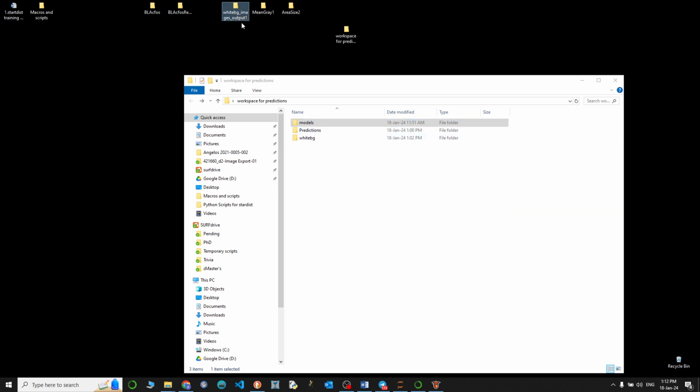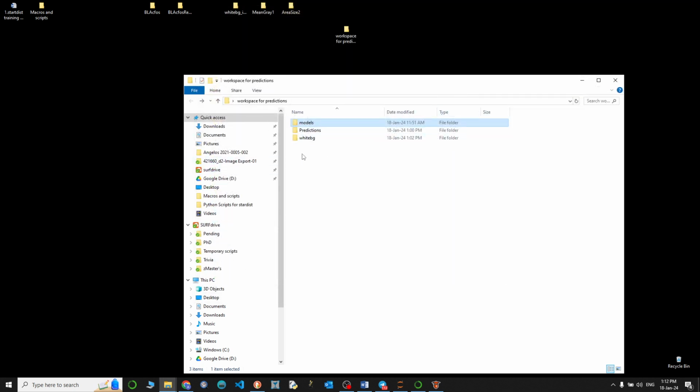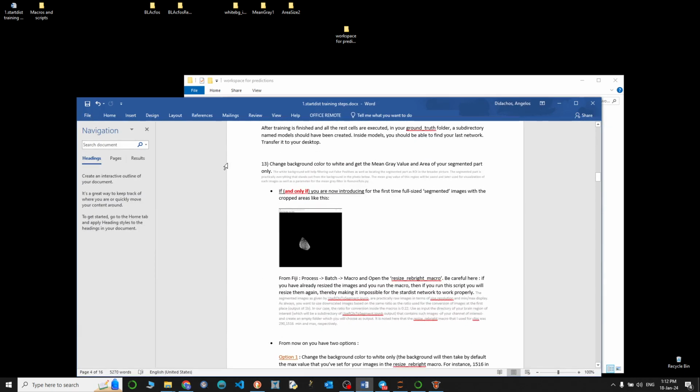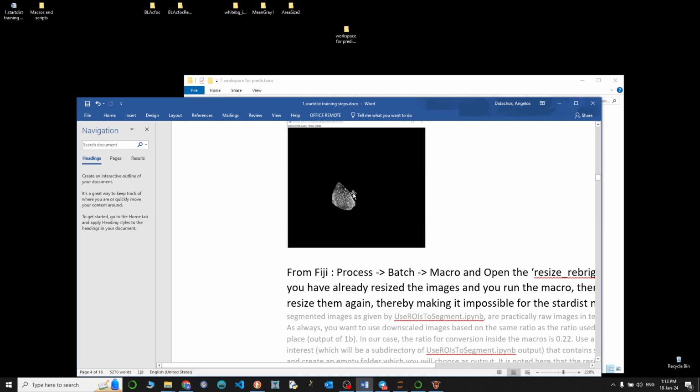It's exactly the same. It's the white background images that we produced, and we're using white background images because any contour related false positives of StarDist will be at the outer part of the segmented area. So imagine that you have this image but with the white background, and you have, let me see if I can zoom, false positives across the contours, right?